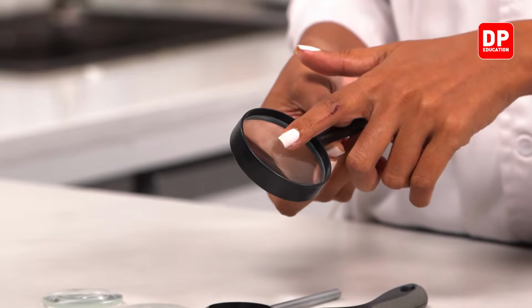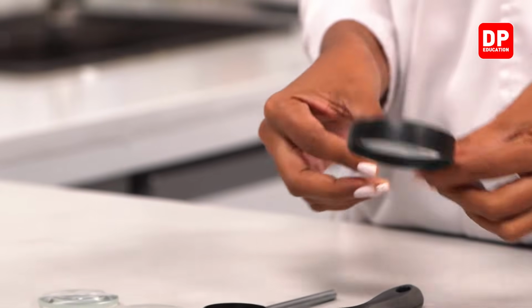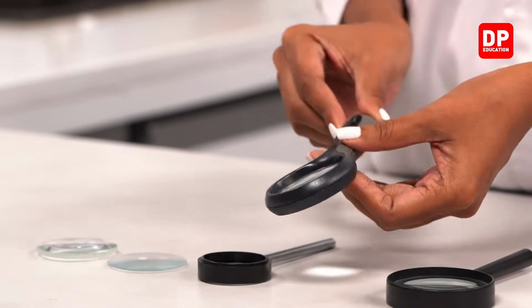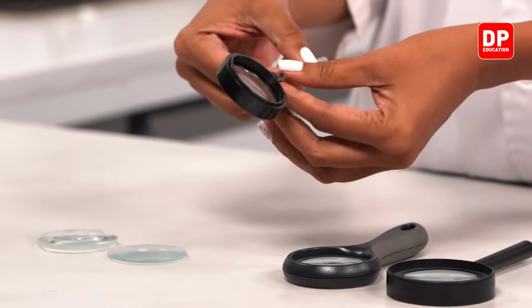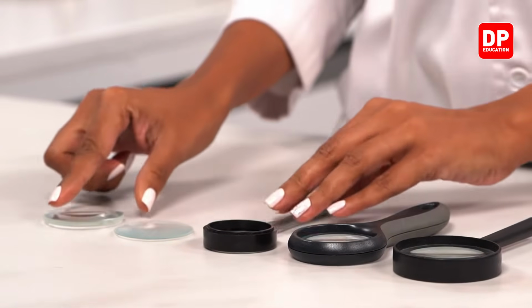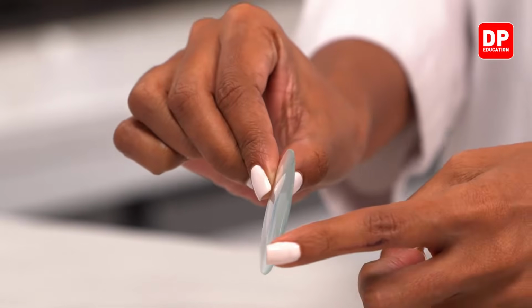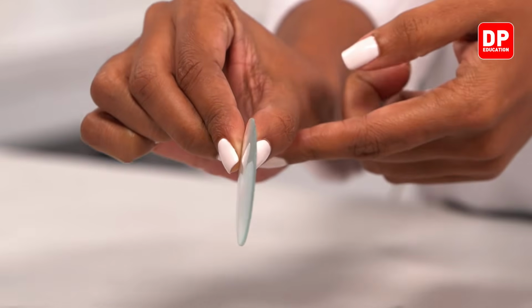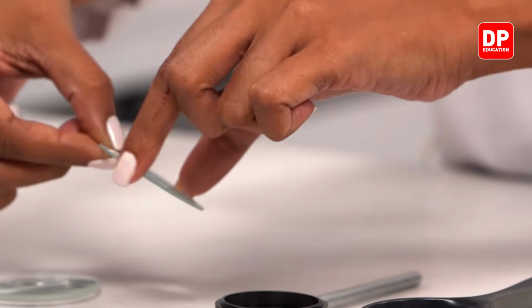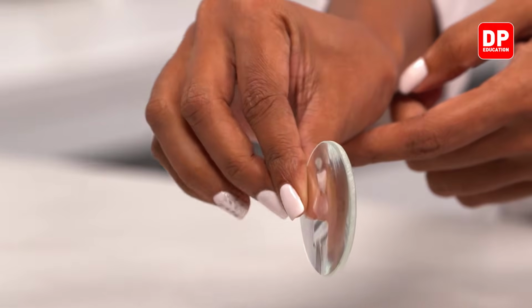So what is this lens, children? This is a convex lens. Convex lens is curved outwards. Okay? Now here, this is another type of hand lens. This is a smaller hand lens. So now these are the convex lenses. Now check whether you can see that this convex lens from both the sides, they are curved outwards. Right. Now this convex lens is thicker than the first one. Check whether you can see that.